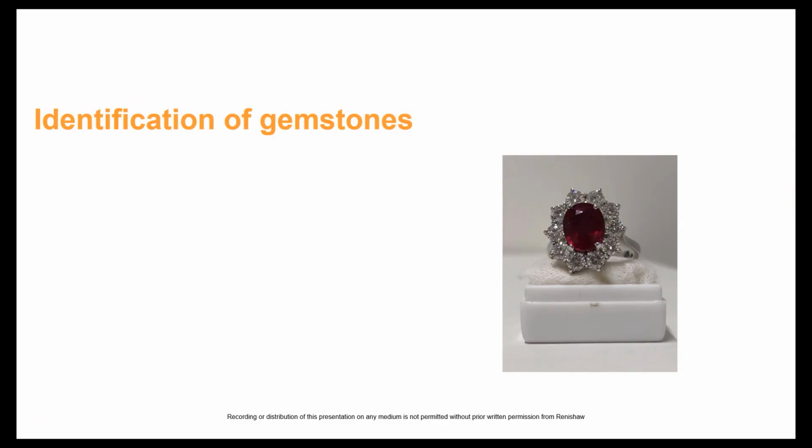Next, we're going to look at how we apply Raman and PL to a range of different samples. First, we're going to look at how we can go about and identify different unknown materials.